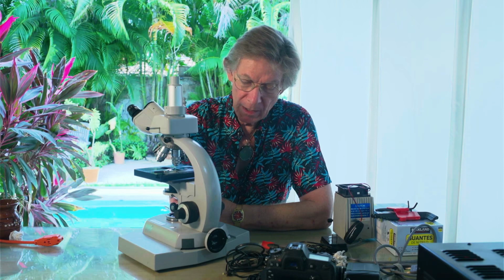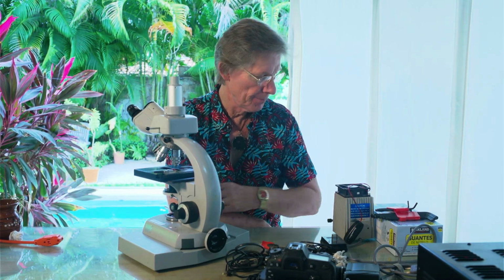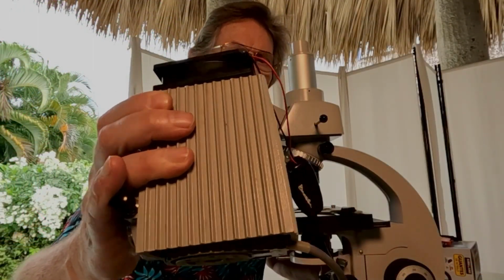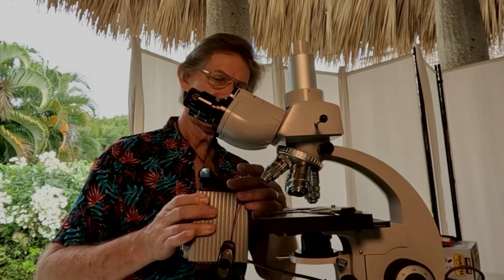So let's get back to the microscope. The microscope needs light, a lot of light. In fact, this microscope was designed for a 100-watt light bulb. And the light bulb goes in this thing here, and we can go over and have a closer look at it. This is called the light source or light box.